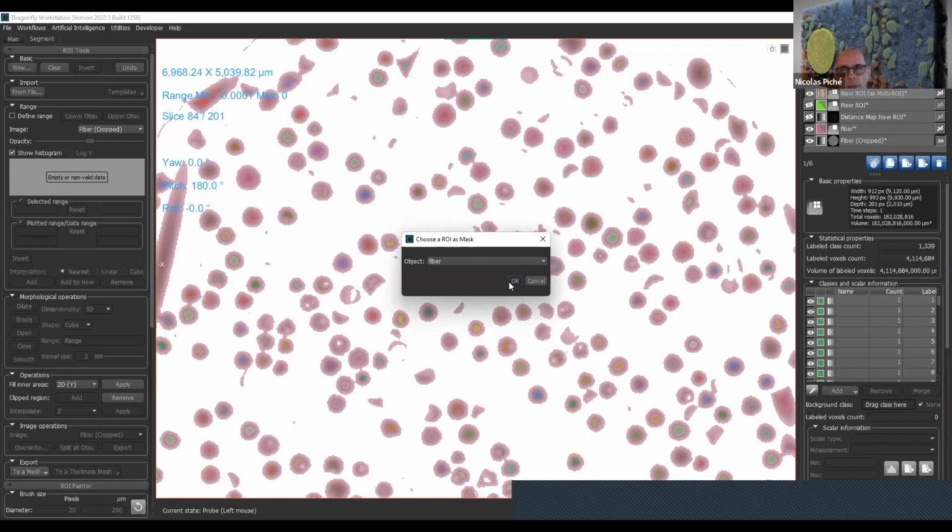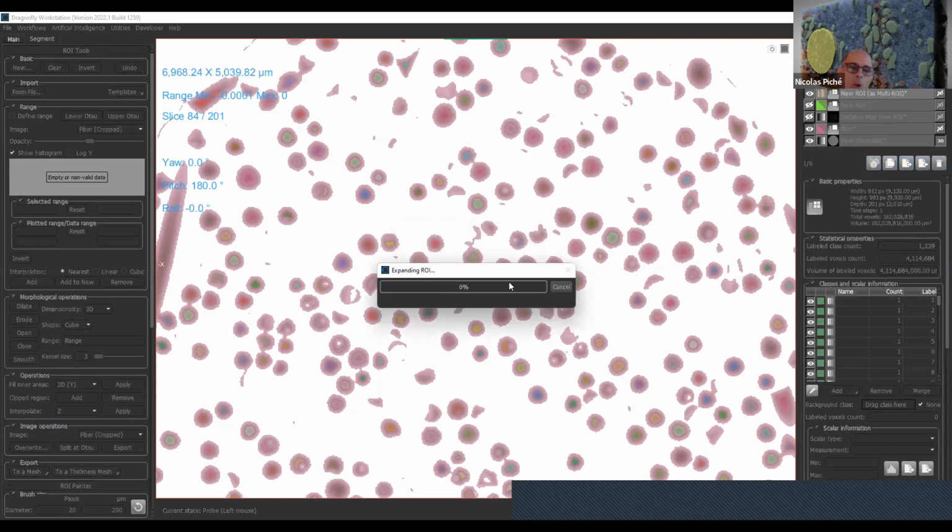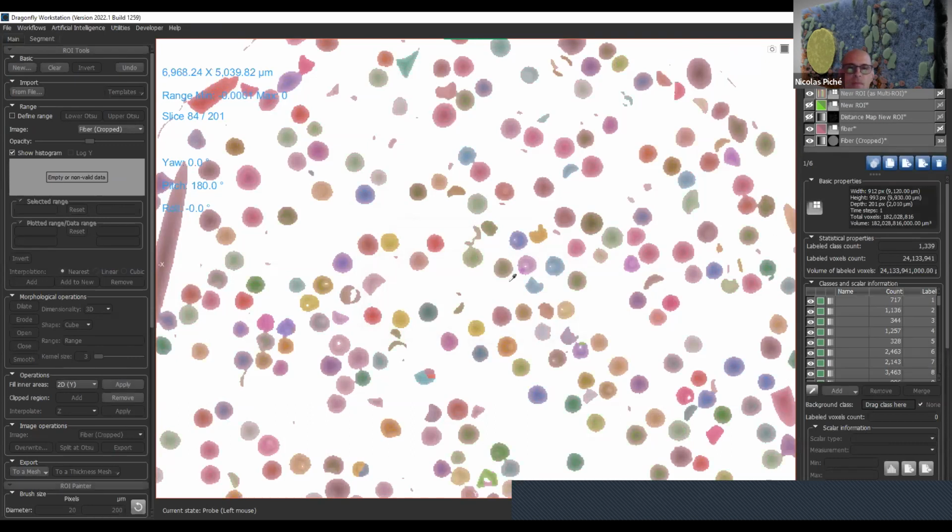a watershed. Now it's doing the watershed, it's growing the seeds in the mask. The only error I could have made is inverting the mask or not. I don't remember if I specified the interior or the exterior, but at the speed it's going, I think I did the right thing. So now the colors should have grown and they are separated, kind of, okay?